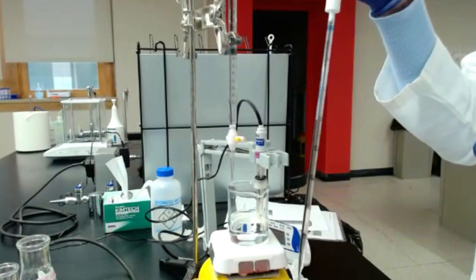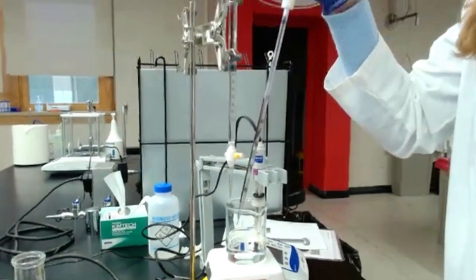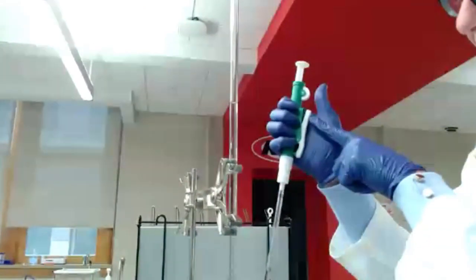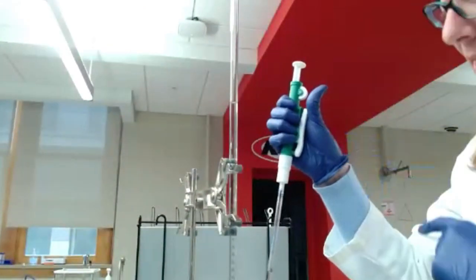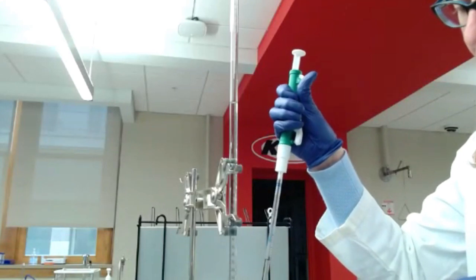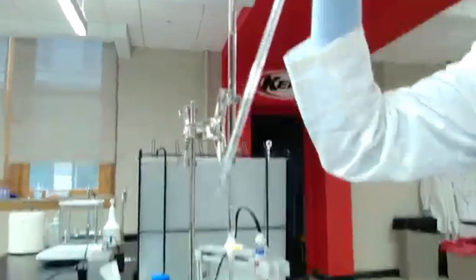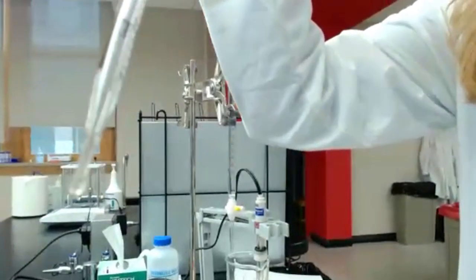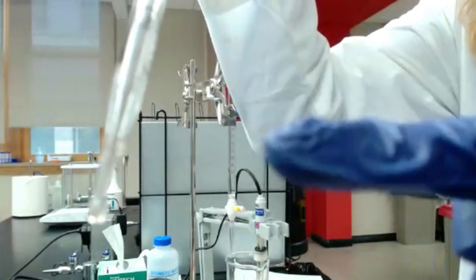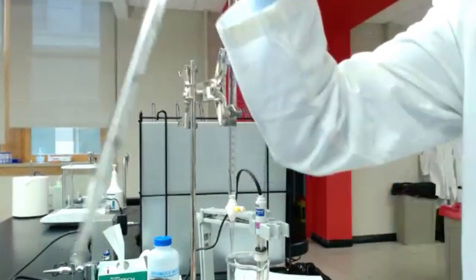Once I have that, I will just transfer directly into the beaker, and I can push here to release the juice. All right. You might still have a little drop in the pipette, but that's part of the error of the pipette. So don't touch that little drop. You don't need that drop.